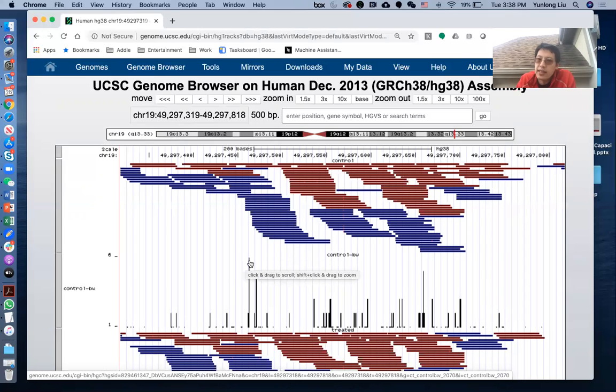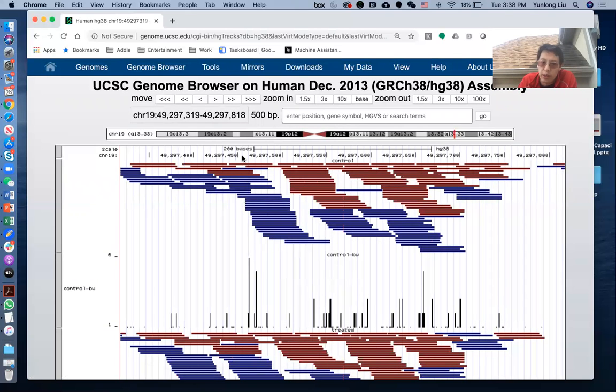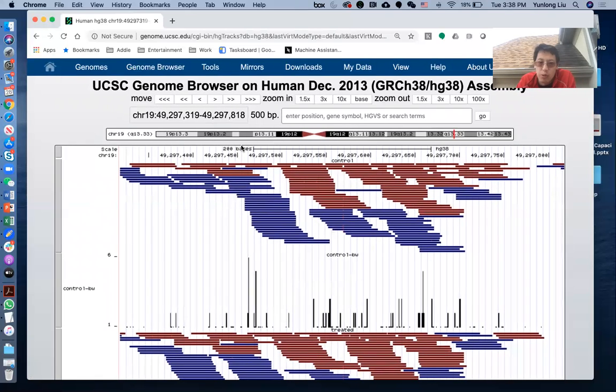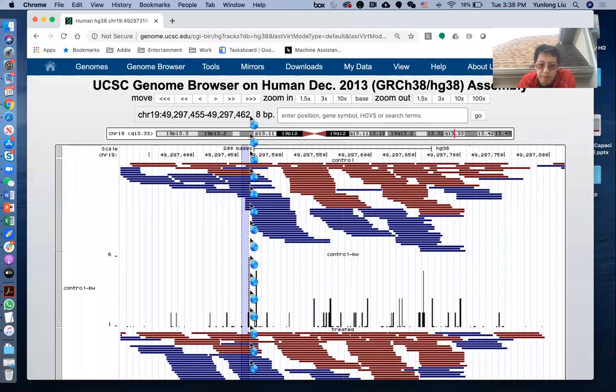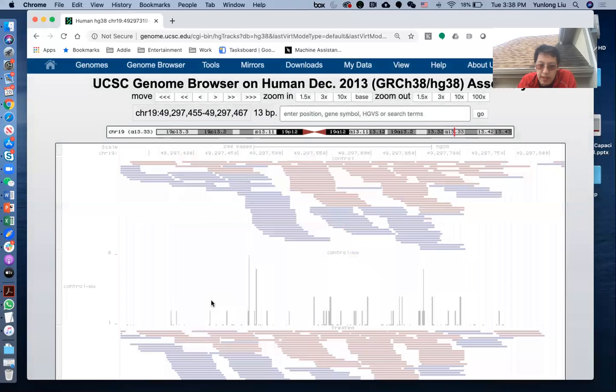In this case, what we are calculating here is the number of cutting sites we identified at each location. For example, here, this part will potentially be aligned to this region. Let's go into there, because this is ATAC-seq. That's why we're doing this. So now let's go here and take a look. Now I'm zooming in.